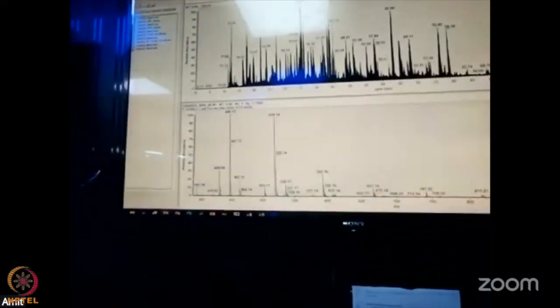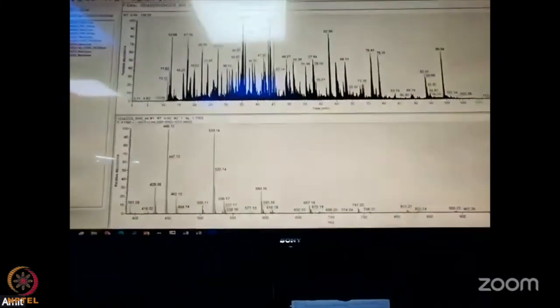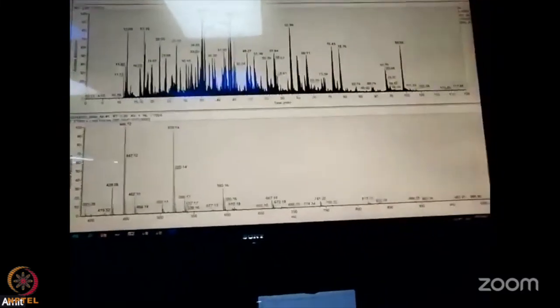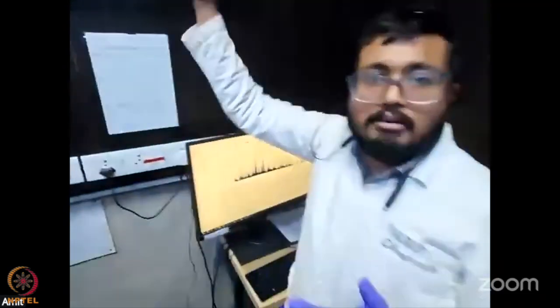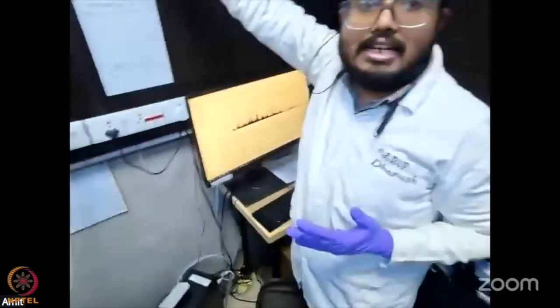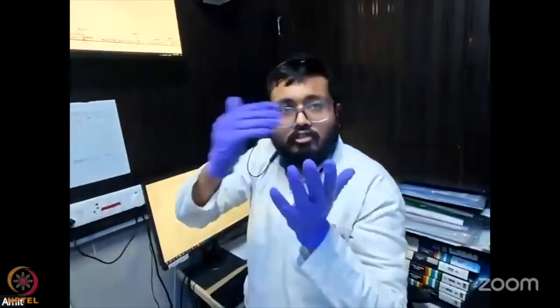But this is the total ion chromatogram of the MS1. If you want to look at a particular precursor, you get its MS/MS fragments. For any precursor m/z, that is the total molecular weight of the peptide followed by the charge, you get its fragments.